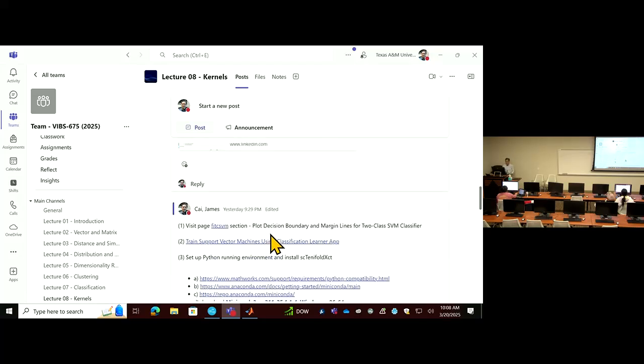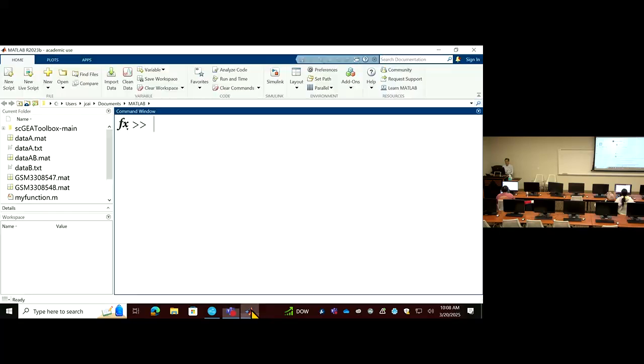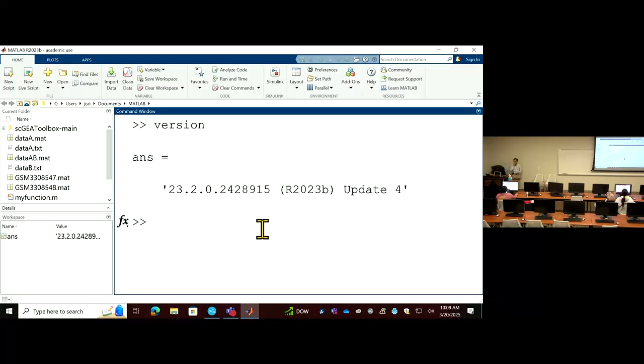All right. So let's first visit this page called fitcsvm, to do it in MATLAB. Just before that, let me know what version of MATLAB you are using.